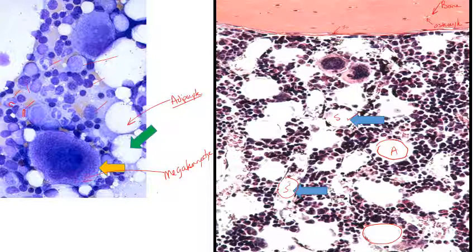cells. I'm sure some of you may have already taken the Moodle quiz, and you'll have noticed that this picture was used in a question about the layers and levels, and you're like, well, I have no idea. Well, it's osteoprogenitor cell, and then you have the marrow, endothelium, all that stuff. So just know that that's a hard question. But for the general purposes of what's going on right here, we know that's a megakaryocyte, that's a megakaryocyte. And this is pretty much zoomed out. We could stay here forever and try to identify cells.